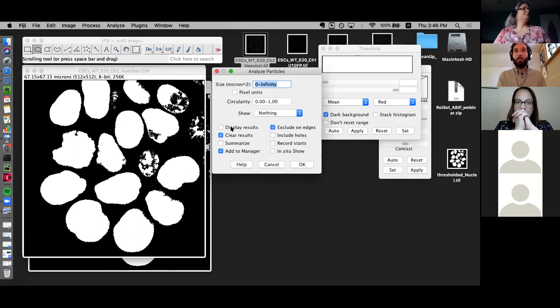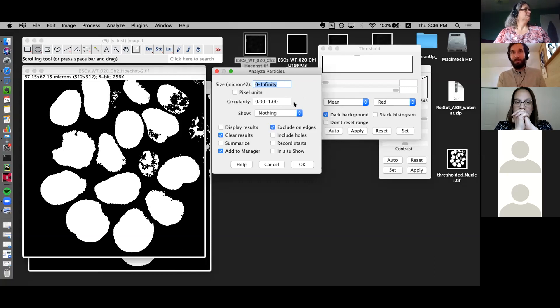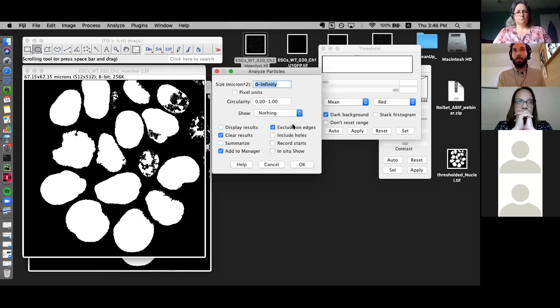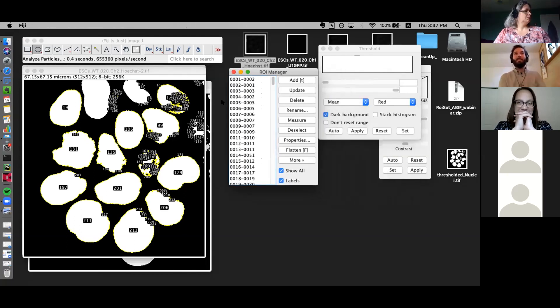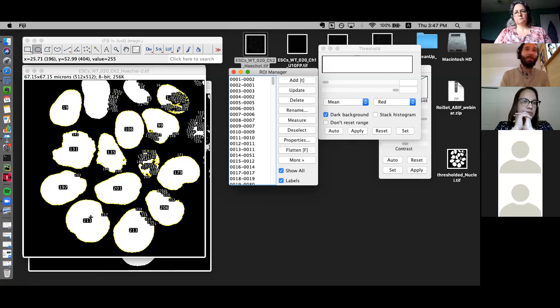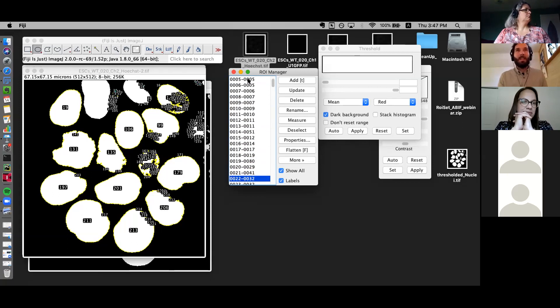Let's hit Analyze Particles and leave these settings as they are — take all particles from zero to infinity, all shapes, zero to one circularity, clear results, add to manager, exclude on edges, and say OK. This is good, not great. We have a few very nice large nuclei, but we also have a lot of very tiny ROIs corresponding to individual pixels, little bits of noise, or lower-intensity fragments. We don't really want those most of the time.